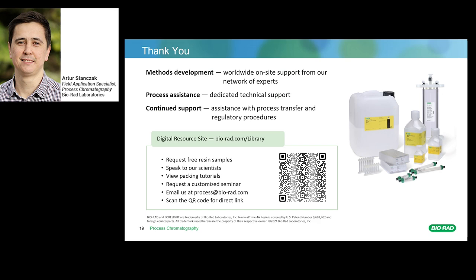All right, well, it looks like we're running a bit short on time, so if we don't get to your questions, we'll be passing them along to Artur, who can follow up with you directly. So please go ahead and continue to type in any questions you have, and we'll get those passed along. The last question for the webcast is, what if an ion exchanger cannot be used in the purification process?